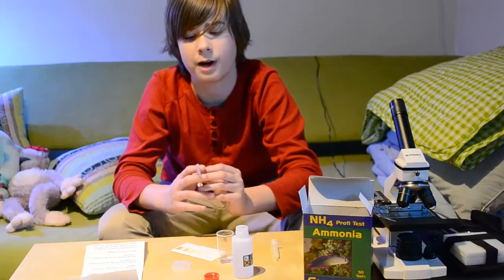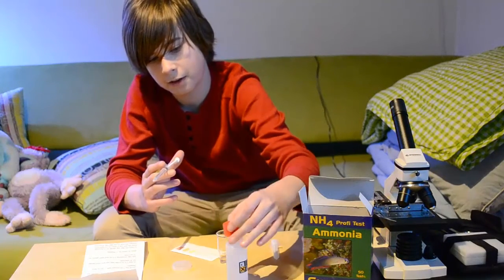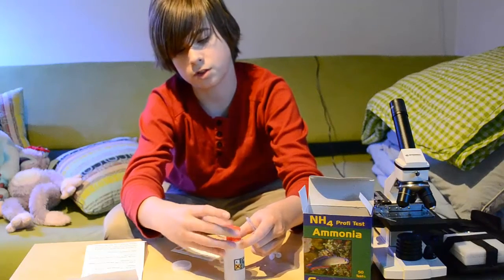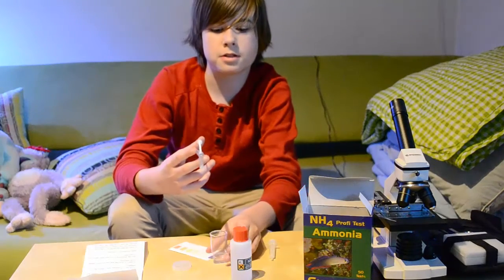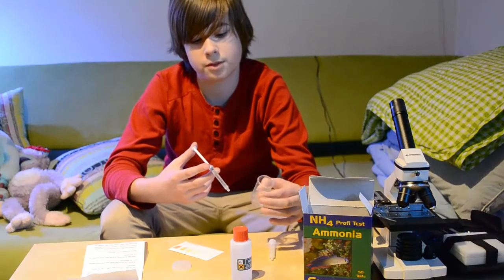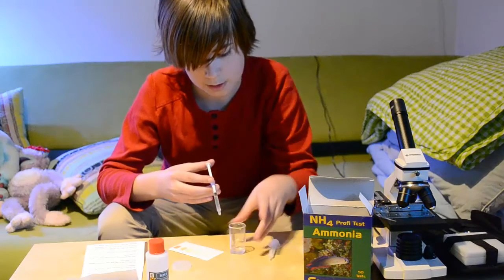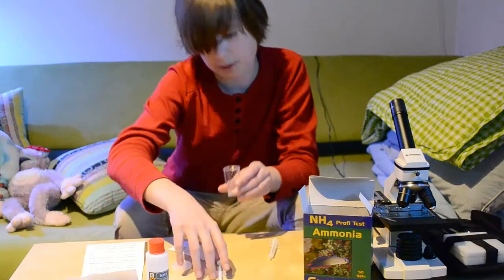There are poisonous things in there, bacteria and chemicals that are harmful, and also corals that can stain you. With the 1 milliliter syringe, you need to add 0.5 milliliters of NH3 down to the bottle. What people usually do is add it drop by drop while shaking, but you don't need to do that — just put it in. It should be down at exactly 0.5 milliliters.